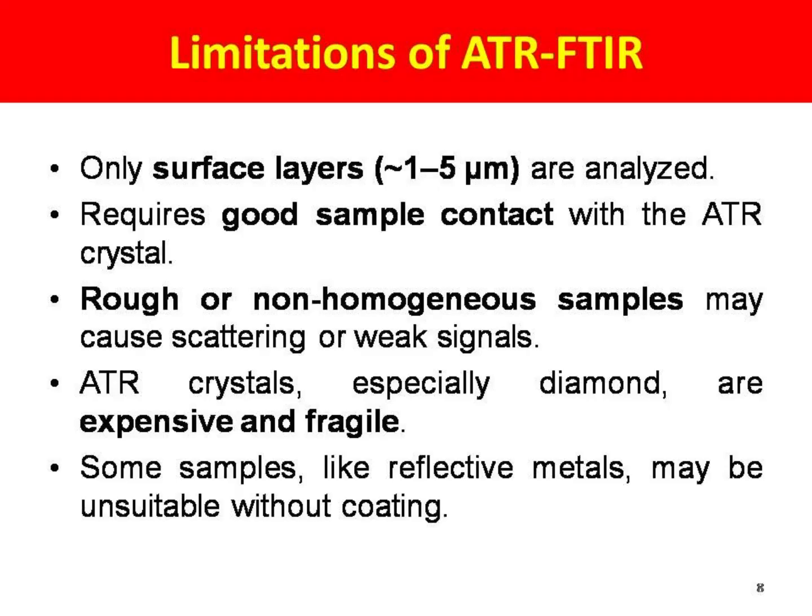However, the limitations are that only surface layers are analyzed, and it requires good sample contact with the ATR crystal. Rough or non-homogeneous samples may cause scattering or weak signals. ATR crystals, especially diamond, are expensive and fragile. Some samples like reflective metals may be unsuitable without coating.